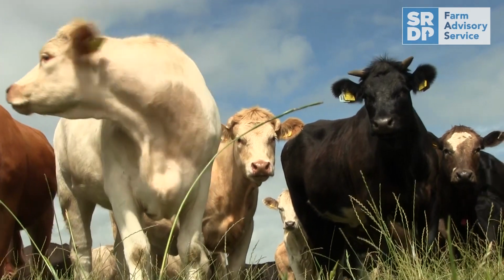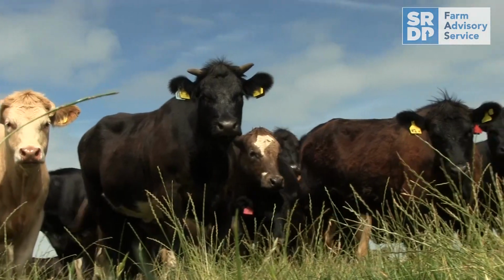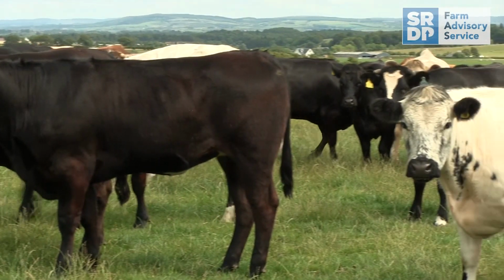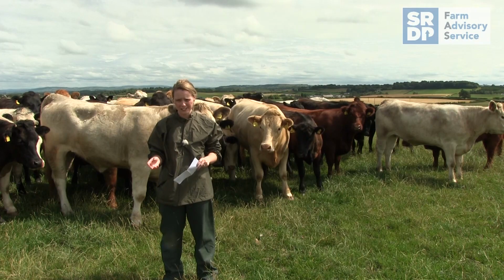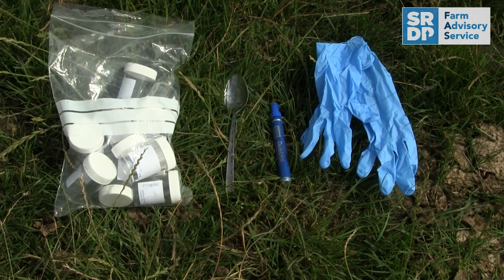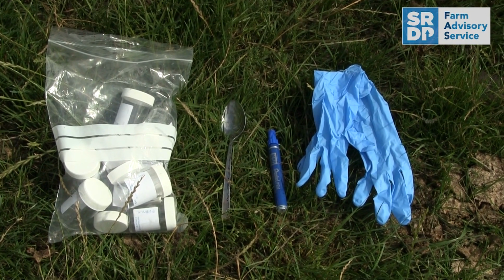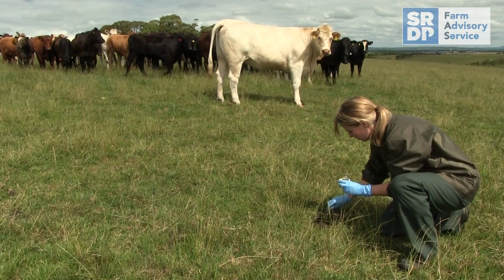So the main reasons for performing faecal egg counts is to diagnose clinical disease, to provide an indication of how contaminated pasture is, to determine the infection in bought-in animals, and to determine if treatment is warranted or if it has been effective. You need 4 heaped dessert spoonfuls per animal. Take from at least 3 areas of the dung pat and mix well. Collect samples in lidded pots and eliminate air, otherwise eggs may hatch and not be counted.